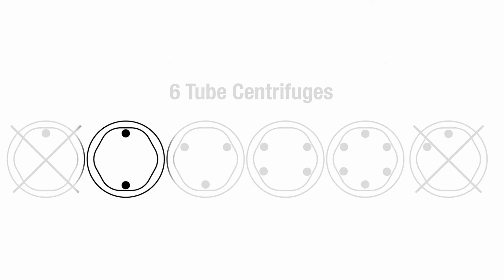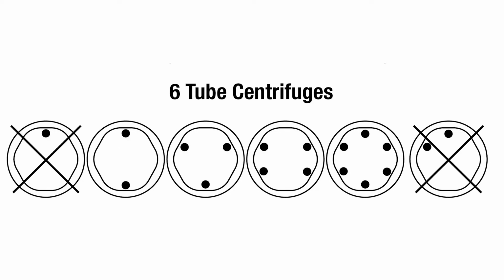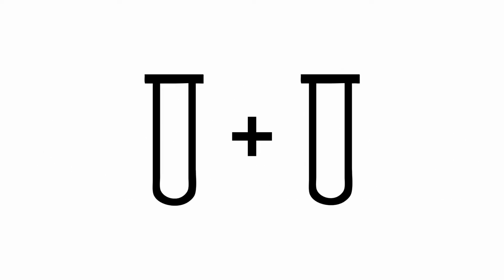So, if we're loading 2 tubes, put them across from each other. If it's 3, make a triangle. 4, a square, and so on. If you're spinning an odd number of tubes, you'll need a counterbalance tube. First, figure out which of your tubes needs the counterbalance. It'll be the one without a tube across from it.